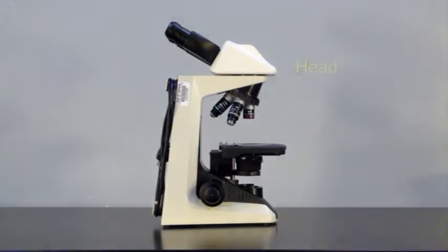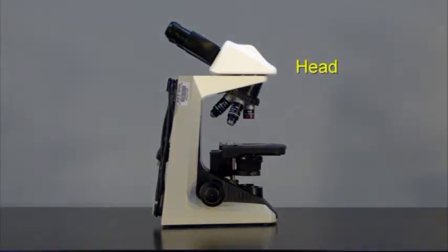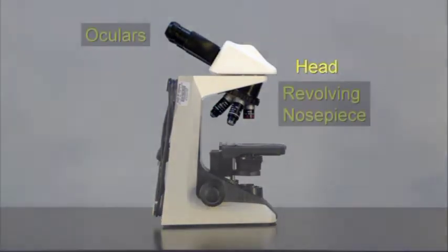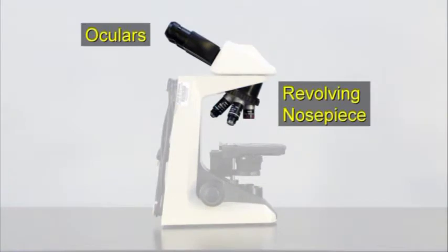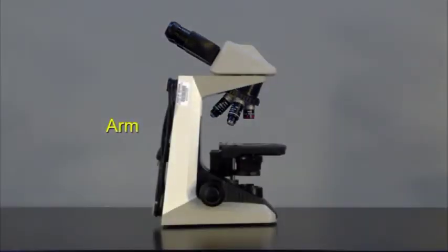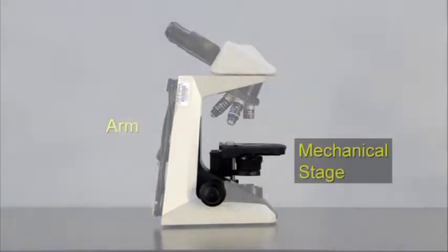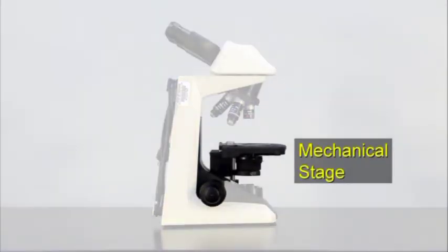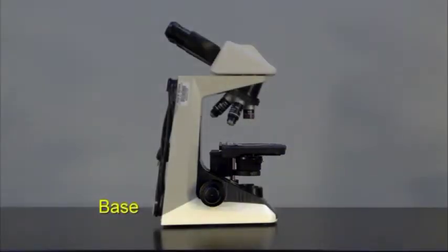The top section is the head, which supports the oculars and the revolving nose piece. The arm is the section that supports the head. It also supports the mechanical stage, which holds the slide. The section at the bottom is called the base.